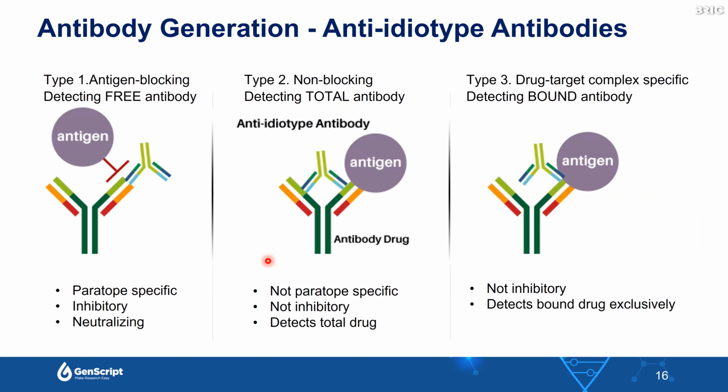Anti-idiotypic antibodies are antibodies that bind to the antigen binding site of another antibody or biologic. Anti-idiotypic antibodies are an important downstream reagent for specific drug development assays, which include PK and ADA, and other applications such as diagnostic assays and biomarker discovery and evaluation. There are different types of anti-idiotypic antibody binding. The key success factor in the development is to understand the intended applications and design a proper screening cascade for the selection of the ideal anti-idiotypic antibody.